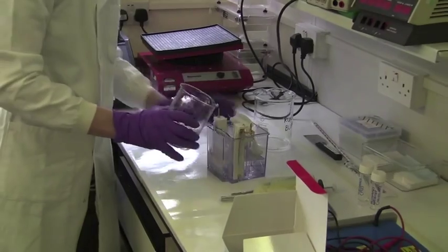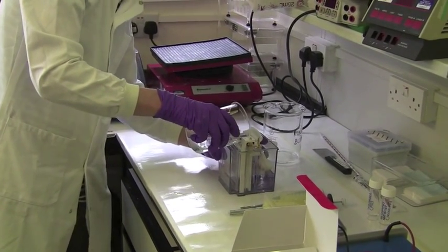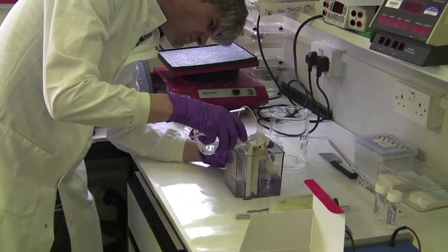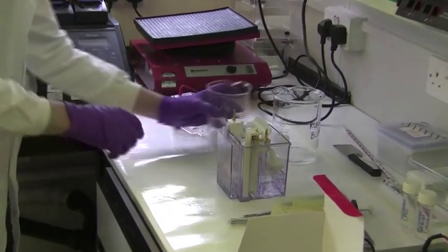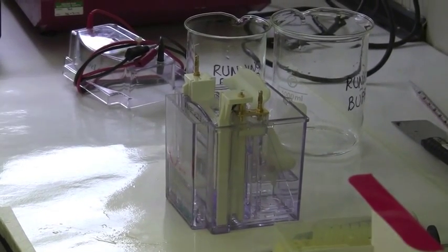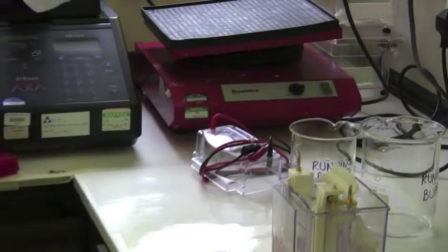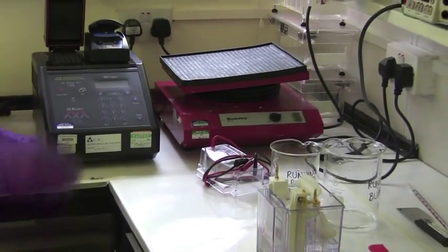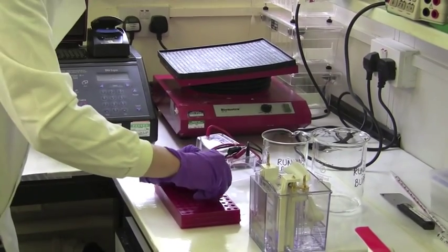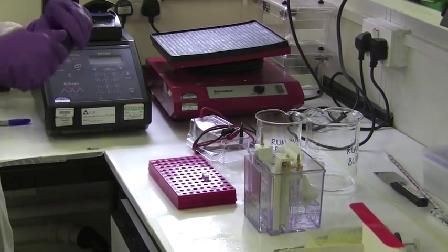In order to ensure correct flow of current through the gel, running buffer is added to both compartments of the gel tank. Samples are removed from the heat and pipetted carefully into the wells at the top of the gel.